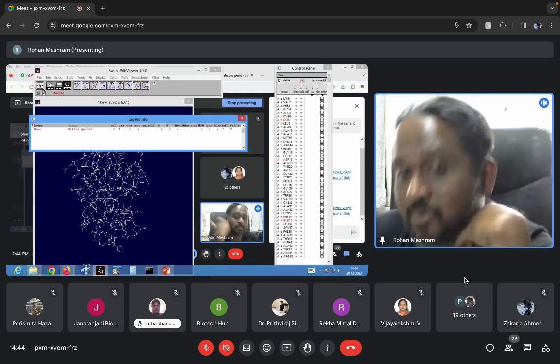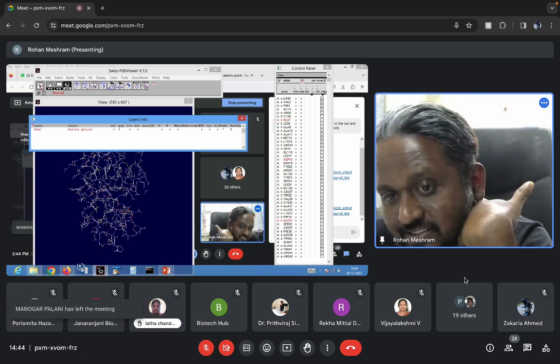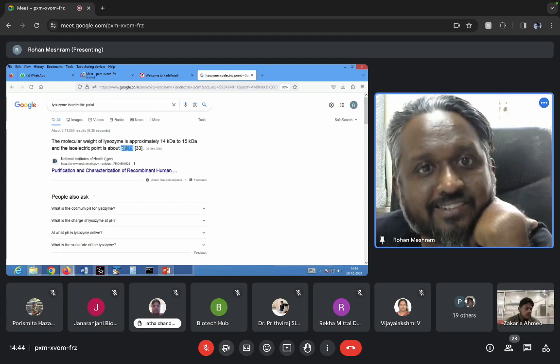We have counted the number of amino acid residues that are basic and compared with acidic, and of course it corroborated properly, right? Its pH is 11. Therefore, it is basic in nature.